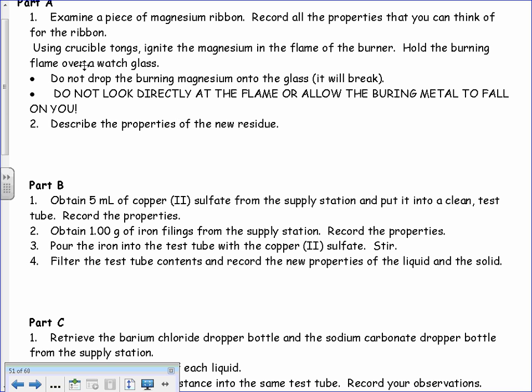We're looking at magnesium. Well, then magnesium went from this silvery thing to this white brittle substance that was on the end of the crucible tongs. What do you think happened to straight up Mg? Mg, can it decompose? Yay or nay? No, magnesium is a pure element. It cannot decompose. So then you're like, okay, well, maybe it combusted, maybe it reacted with oxygen. Well, oxygen definitely is a gas that's present. So it's going to be an oxygen species that's going to react with it.